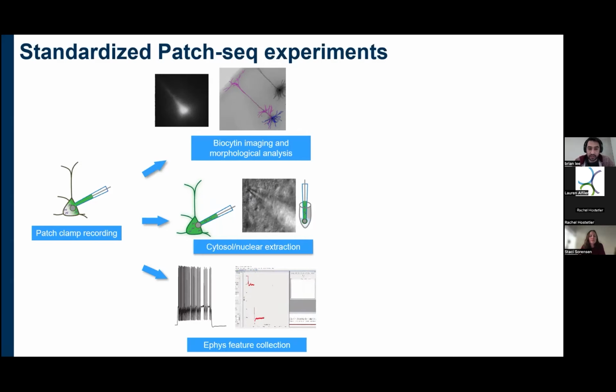But what this does is this allows us to conduct a quick experiment to collect the most cells that we can in a day. But in order to do things quick, we also want to make sure that the data is of the highest quality. So ongoing during this experiment, QC metrics are being evaluated and applied and letting the users know if this cell is meeting the standards for what we have initially designed and set up. So it's a nice way to ensure that the data that we're collecting is of the utmost quality.